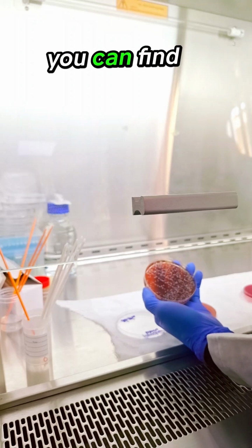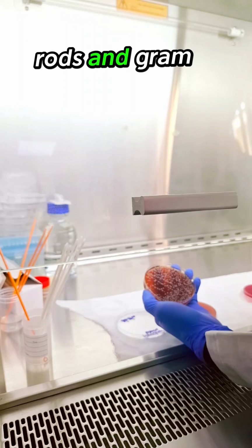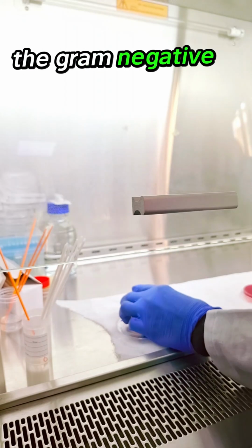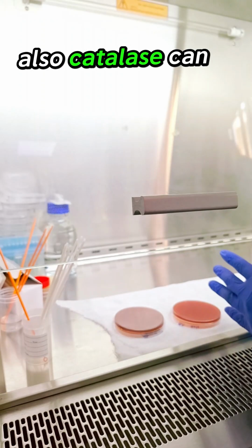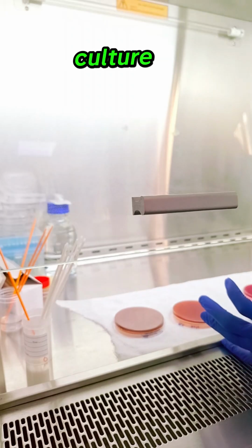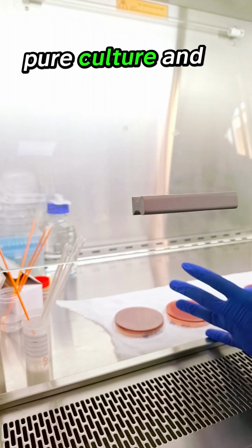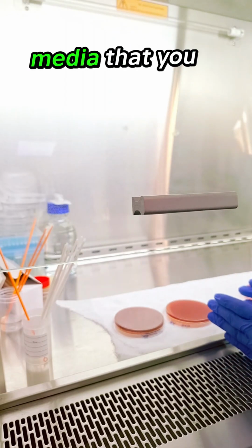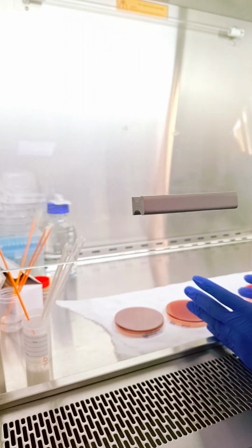You may have gram positive rods and gram positive cocci, or gram positive rods and gram negative cocci, in the same slide. Tests like catalase can also give false results because it is a mix of culture. That's why we separate a mixed culture to obtain a pure culture. There are also different media that can be used for this separation.